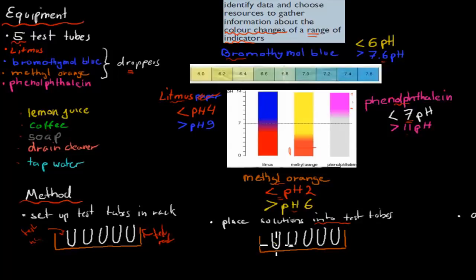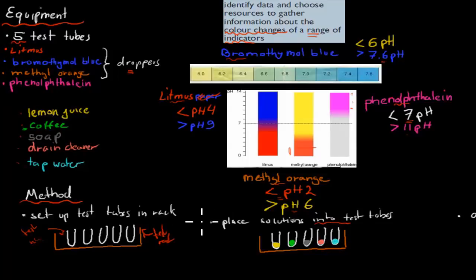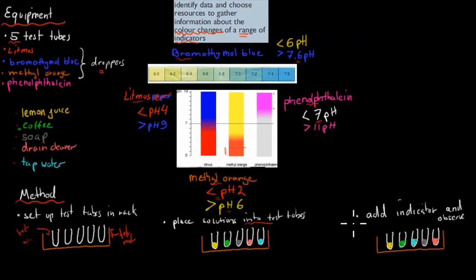The first test tube will have lemon juice, and we don't know the pH — we'll figure that out using the indicators. The second one will have coffee, the third will have soap, the fourth will have drain cleaner, and the last one is our control: tap water. For the final step, we just add the indicators. We have to repeat this experiment four times in total — once for every indicator.